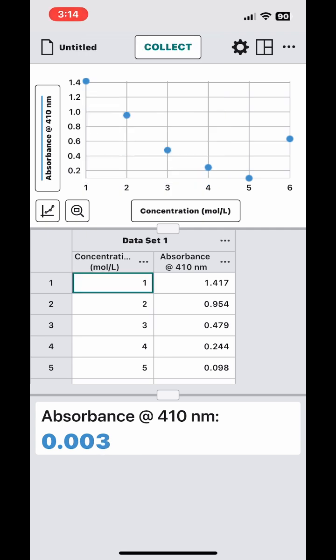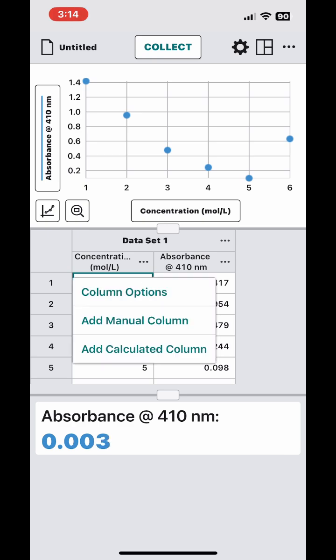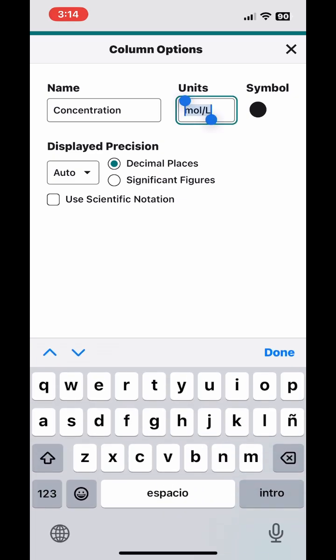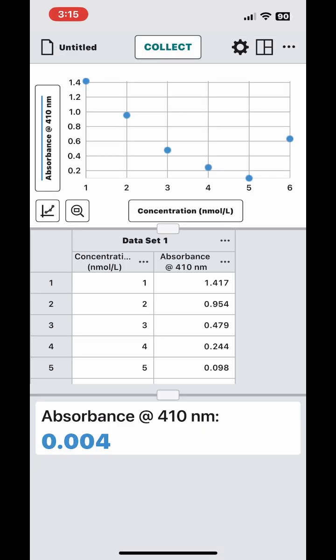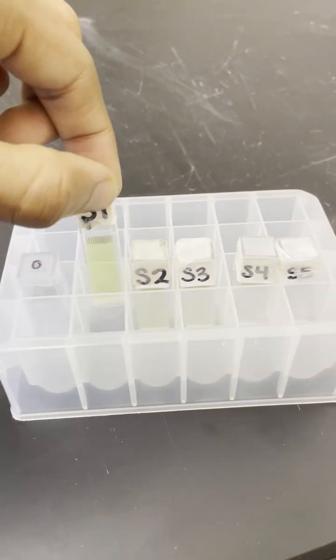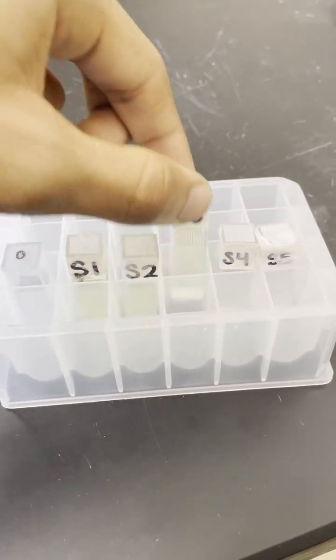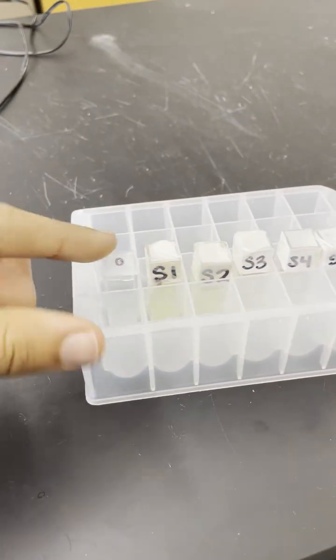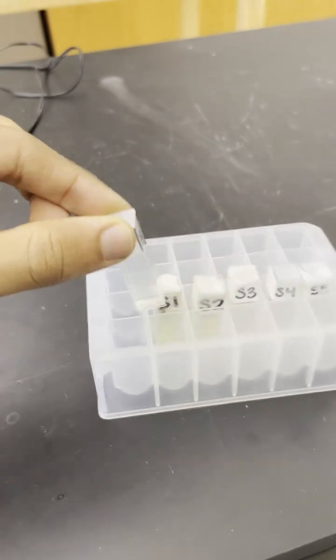Now, the units for concentration are going to be default set to molarity. So if your experiment is like mine and your units aren't in molarity, then you can change it to whatever you need. And I'm just going to change mine to nanomoles per liter. These are the standards I'm using. So known concentrations, S1 being the most concentrated and S5 being the least. And this is also an example of a blank.